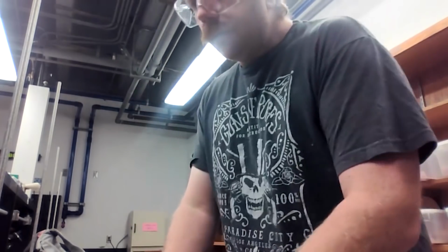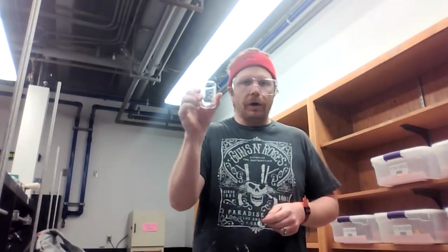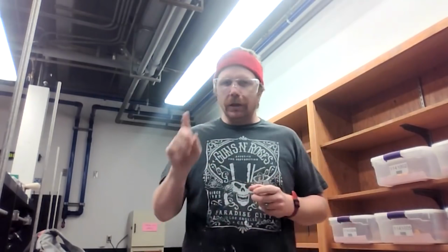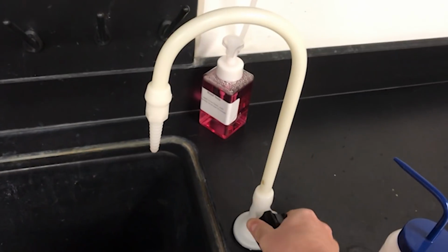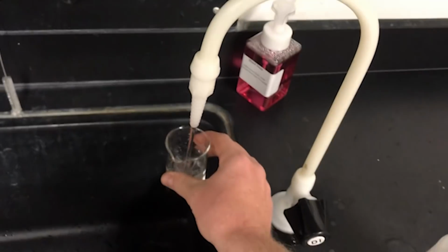Now, my negative control. The negative control asks you to get 100 milliliters, thereabouts, of deionized water. DI indicating deionized water. Now the amount of water in here doesn't have to be specific.